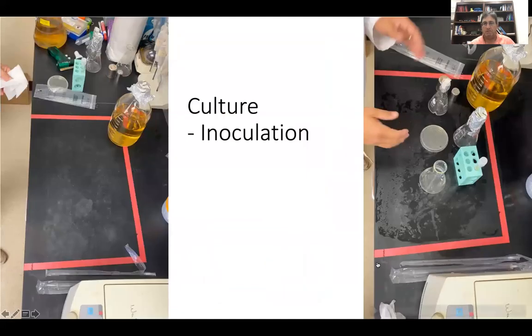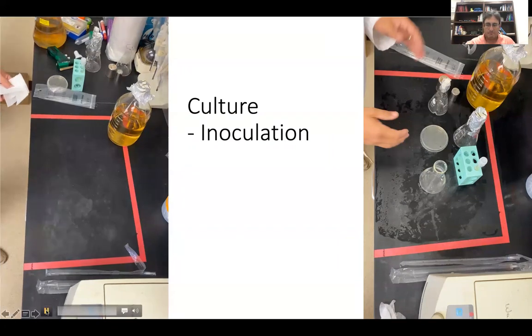So let's show a couple of these examples. Now, what you'll see here is an example where a couple of students and I videotaped some things, and you'll see the process for doing this. And yes, there are no gloves. There should have been gloves, but to be honest with you, these bacteria are fairly safe. I'm more worried about contaminating my cells than these are safe bacteria to work with, but you should wear gloves. It's better PPE to wear gloves than what you see. So let's watch this.